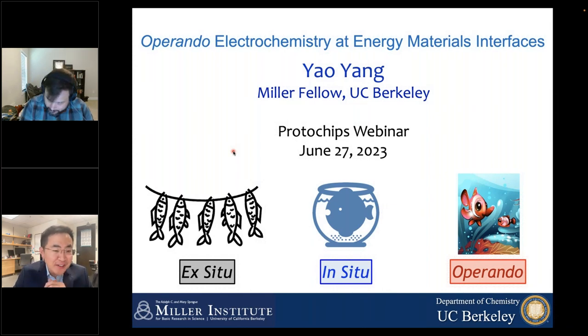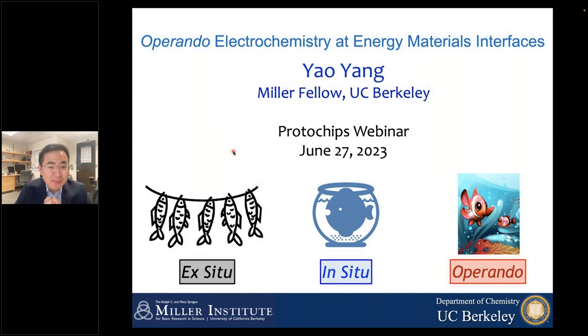Thanks, Tim, for your very kind introduction. Hello, everyone. Good morning or good evening, depending on which time zone you are in. It's my great pleasure to be here to show our research and present the latest progress in developing operando electrochemical methods, with emphasis on electron microscopy and synchrotron X-ray methods, to help us better understand the interface of energy materials. My name is Yao. I'm a Miller Fellow from UC Berkeley. This is a great platform to show how we combine TEM and X-ray to understand the interface.